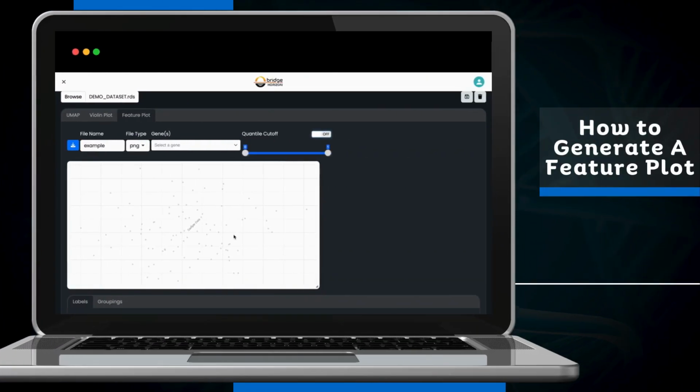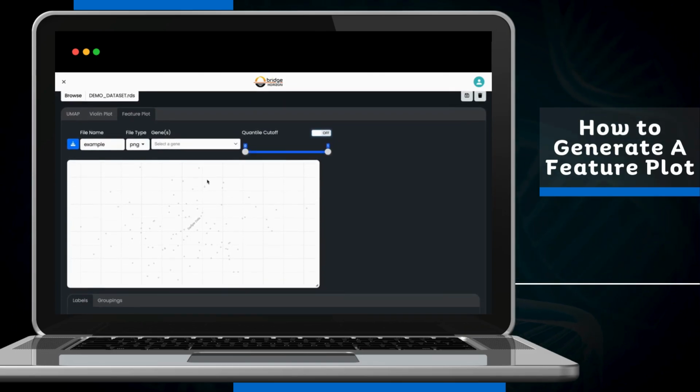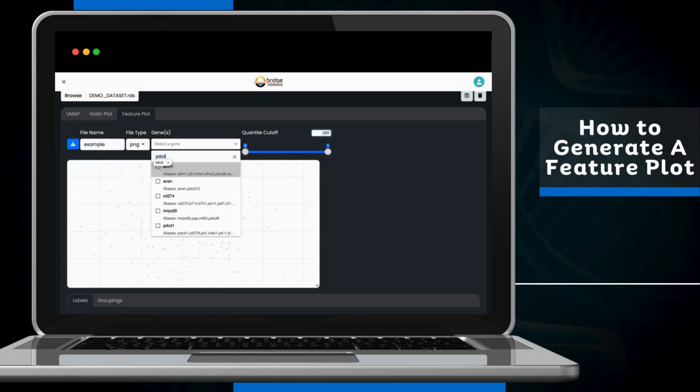In this video, I'm going to walk you through how to generate a feature plot in SCenic Viewer. So in a similar fashion to the violin plot, you can enter your genes of interest within this text area input. So in the violin plot tutorial, we were looking at PDCD1, which is a marker of T-cell exhaustion.